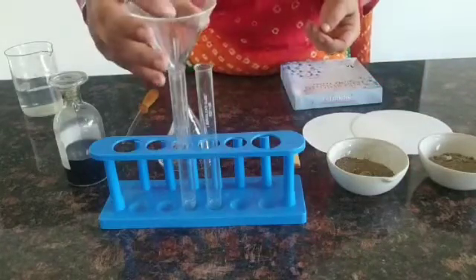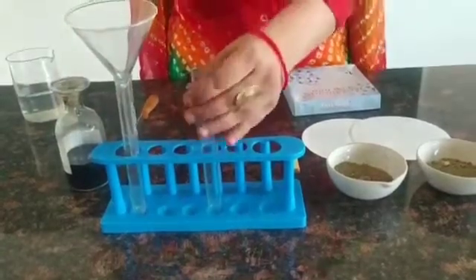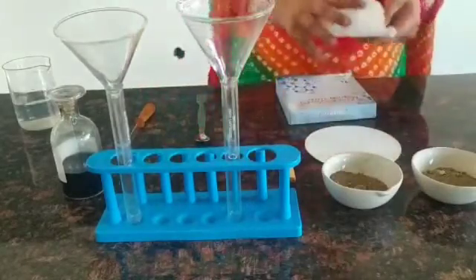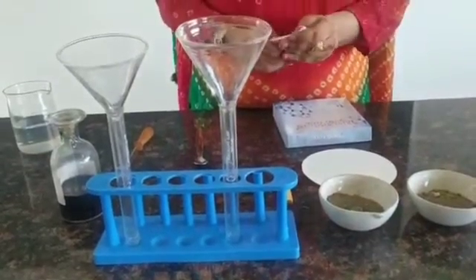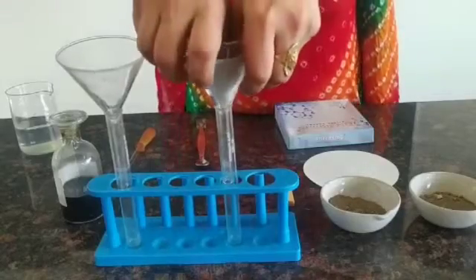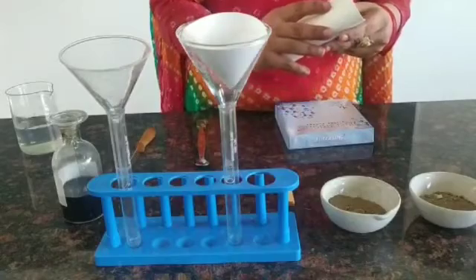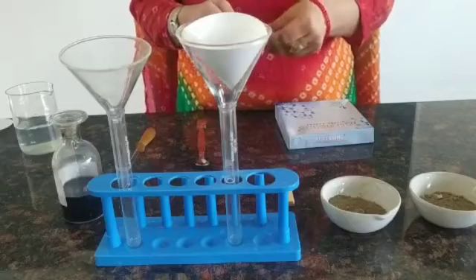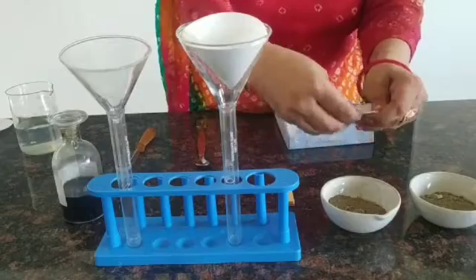We'll place the funnel inside the test tube and then place the filter paper in both the test tubes. We'll fold the filter paper and place it in both funnels. After placing the filter paper, we will transfer the soil samples into both the funnels.